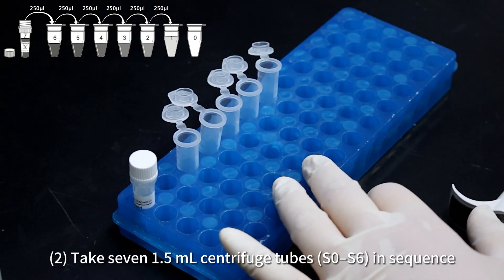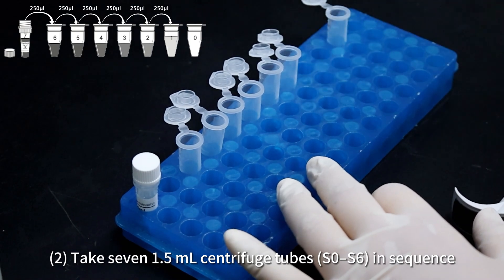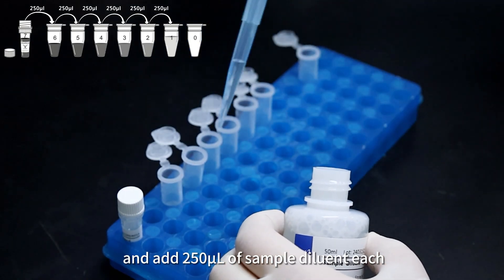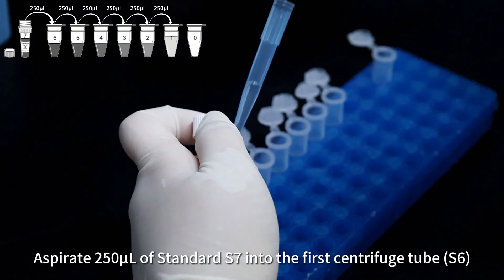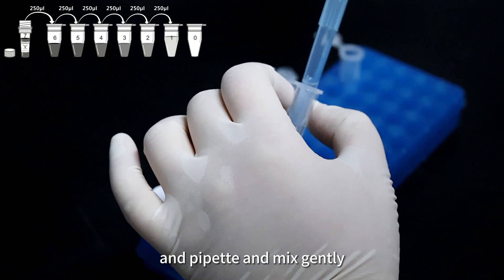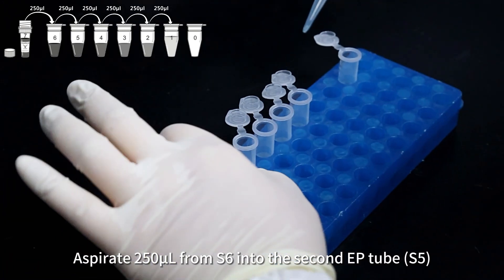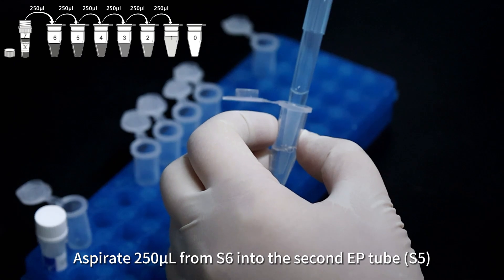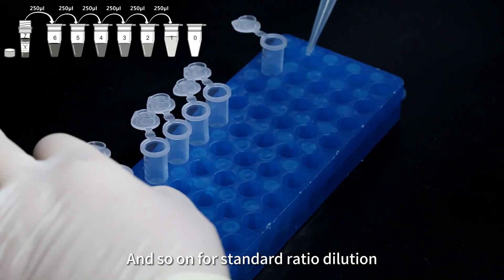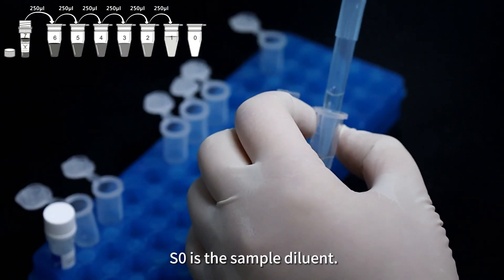Take seven 1.5 milliliter centrifuge tubes labeled S0 through S6 in sequence, and add 250 µL of sample diluent to each. Aspirate 250 µL of standard S7 into the first centrifuge tube and pipette and mix gently. Aspirate 250 µL from S6 into the second tube S5 and mix gently, and so on for serial ratio dilution. S0 is the sample diluent.